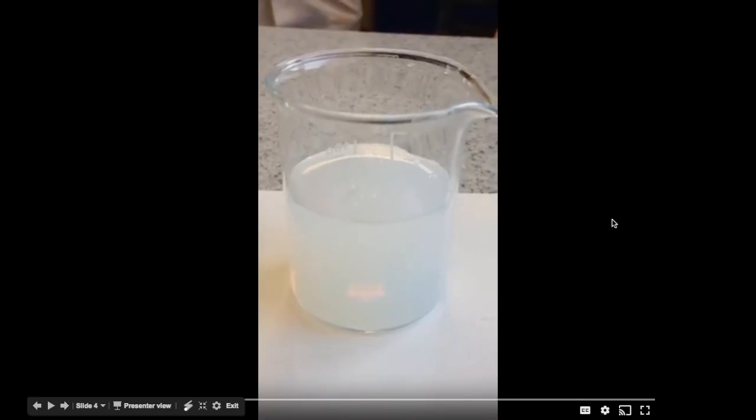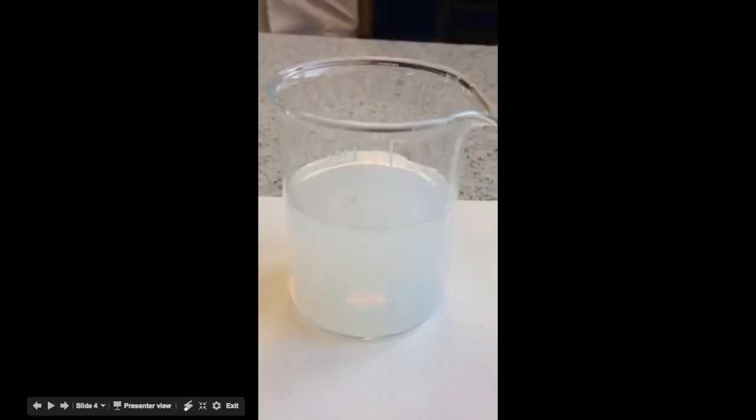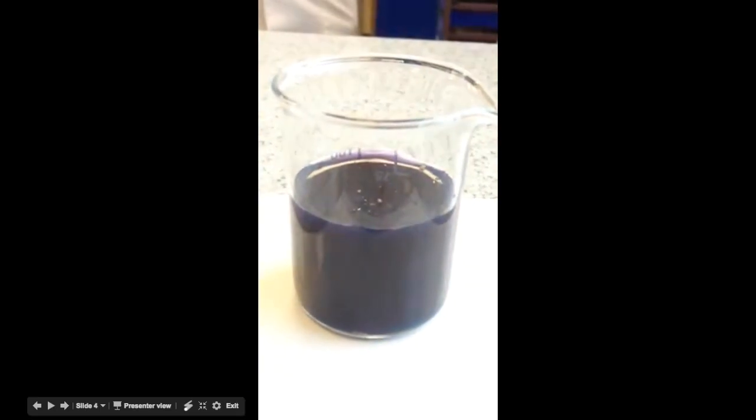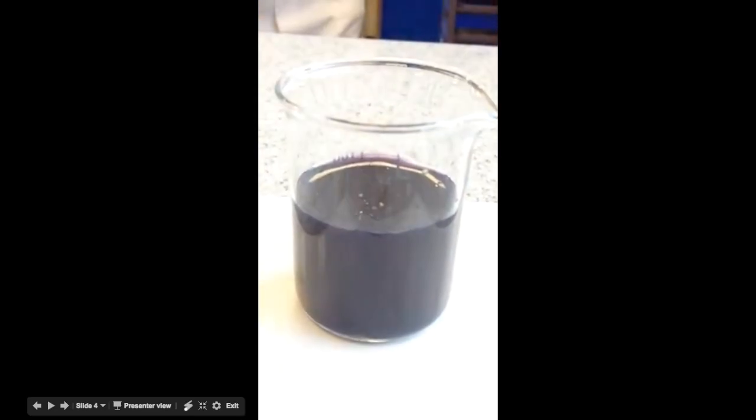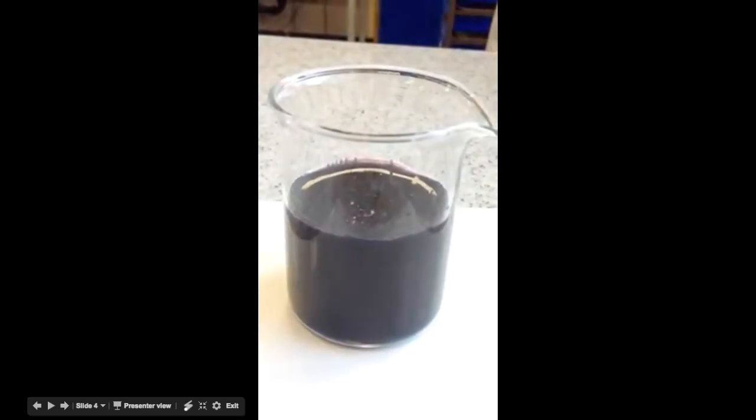The reactants have been placed in the beaker, and when all of the thiosulfate is used up, you can see the starch indicator goes blue-black because of the iodine.